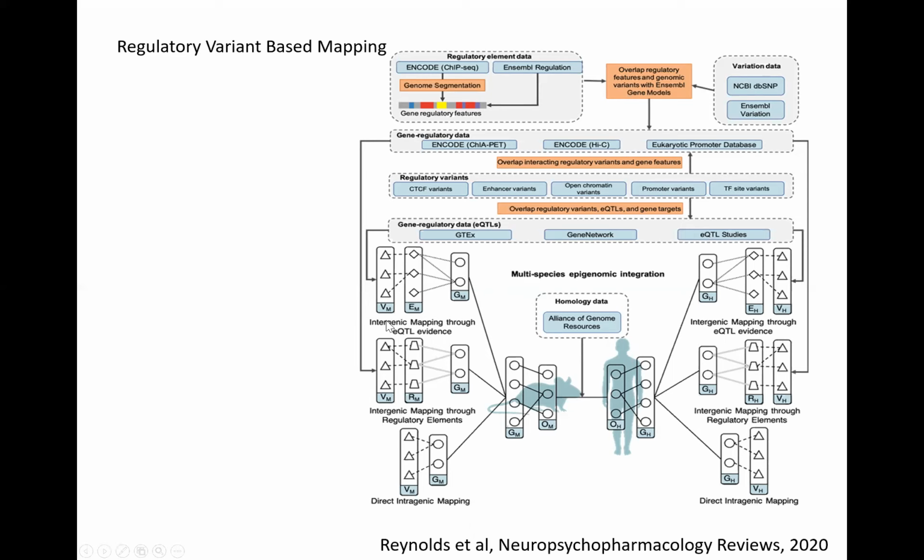These are regulatory variants, variants within genes, eQTLs, and the mouse genes themselves. And so these regulators regulate the gene. The gene has an ortholog in the human, and we could go in and ask questions about regulatory variants in a human.